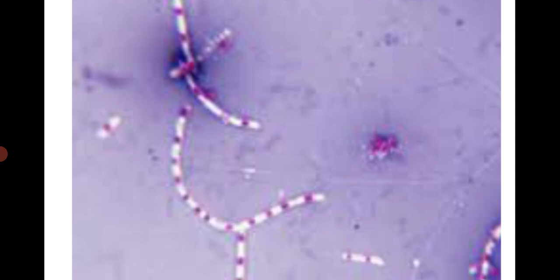So this is an image of endospore staining of a streptobacilli. The bacilli are in chains. The red colored endospore is here, with colorless cytoplasm or colorless vegetative cell, and a black colored background. This is the overall observation for endospore staining.